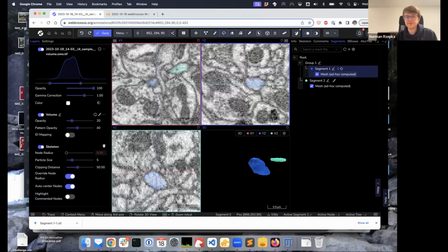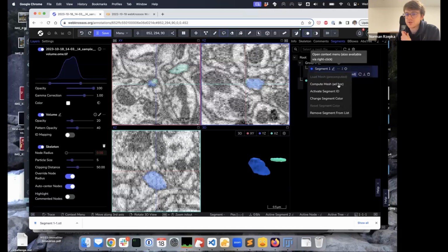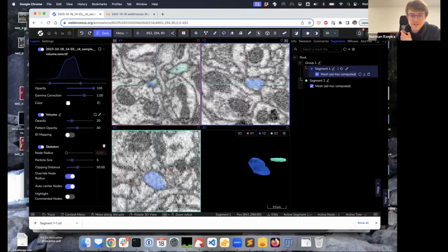So yeah, there's also an eraser tool. It works exactly like the two draw tools that we have. So there's a trace eraser, and there's also, oops, I now draw with the wrong color, and I just noticed that. So let me switch back to this one and just draw over very quickly to correct that. But I was just saying, we have the eraser tool, and it can either work in the trace mode, or if you're in the brush mode, then you can also have a brush eraser.